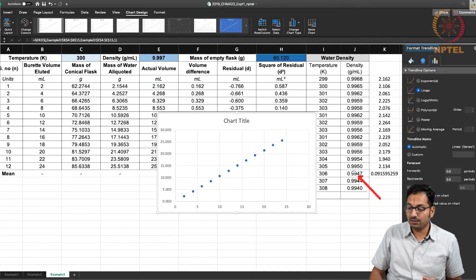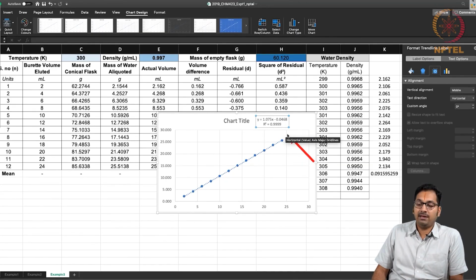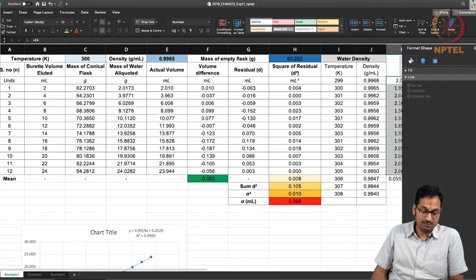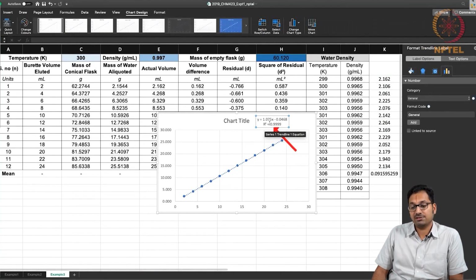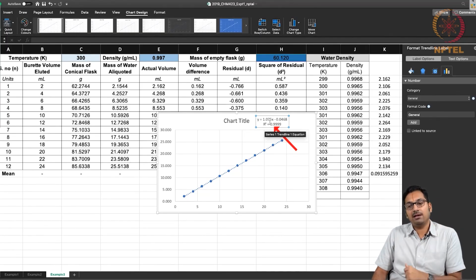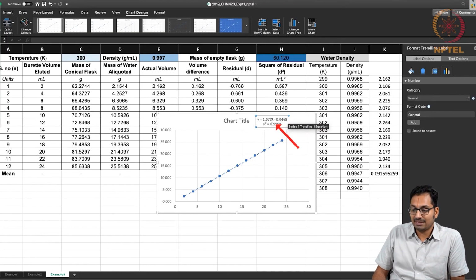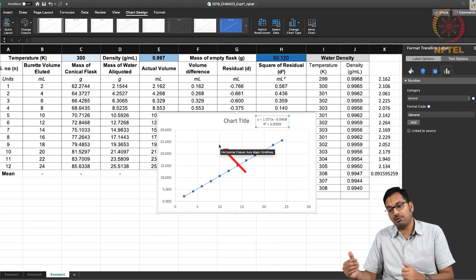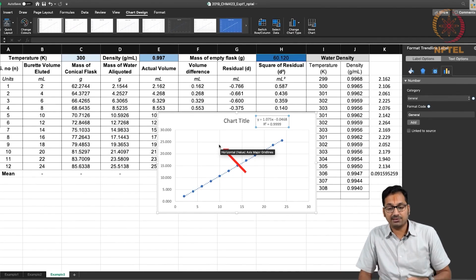You might still end up getting good fits here. You still get an R square of 0.9999, which indicates it's a good fit, but unlike the first example where you had a value very close to 1, something like 0.9919, in this case you are having 1.075, which means that it's about 8% off, meaning that for each measurement you are adding about 8% higher or lower. And the intercept in this case is minus 0.05, which means that it could also have started with a slight shift.